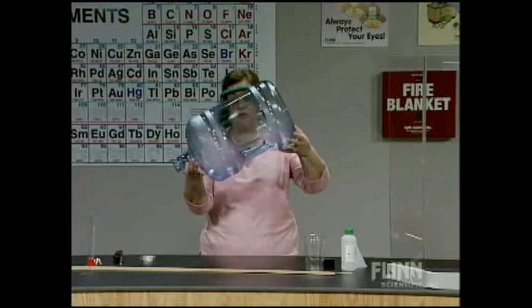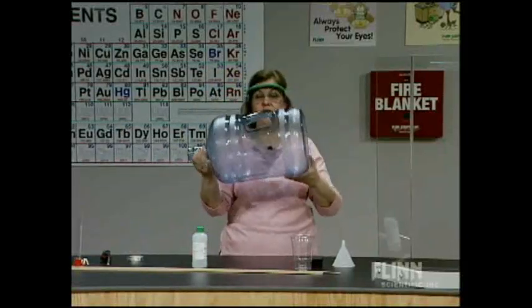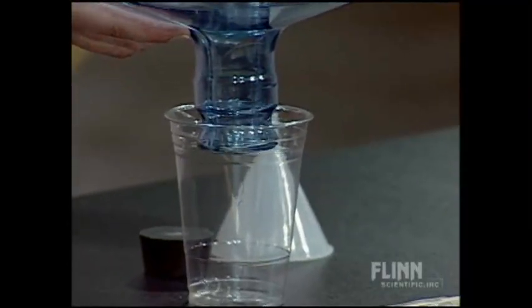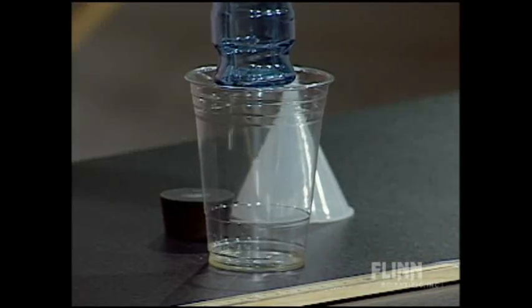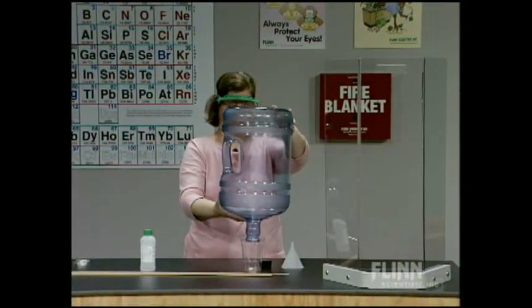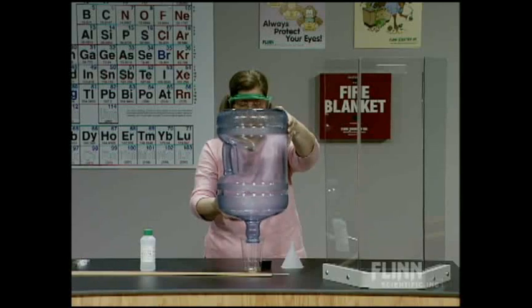I don't see any more visible liquid in there, but that doesn't mean I want to do the reaction yet. It's really quite important that you not have any remaining liquid from a safety standpoint. What I'm going to do is invert that over this cup. In a minute you're going to see some of the alcohol dripping out — if you can see that liquid coming out, I really want to get as much of that as I possibly can. I added about 25 milliliters, so I don't have very much coming off. Hopefully I've converted most of it to the vapor phase through evaporation, but there's certainly some liquid that's going to come off. We're going to let that go for a little bit to be sure that we have mostly vapor in that bottle and not very much liquid.